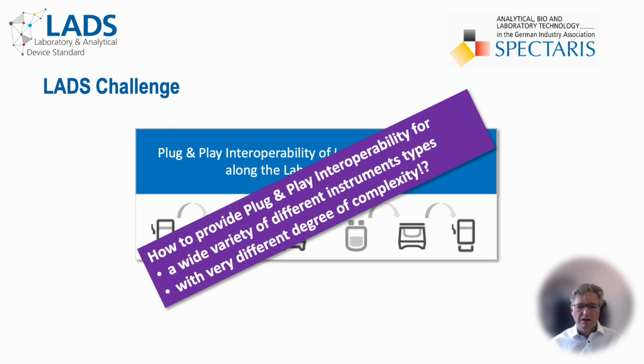But how can we achieve plug-and-play interoperability for such a wide variety of instrument types with vastly different levels of complexity? We achieve this by offering a generic toolbox of standardized building blocks that represent the functionality and capabilities of laboratory and analytical equipment.